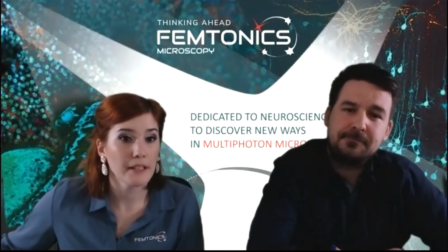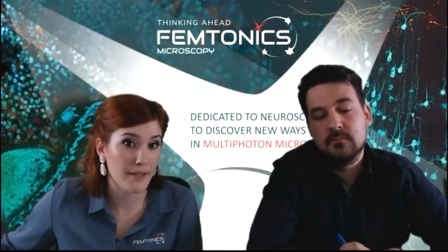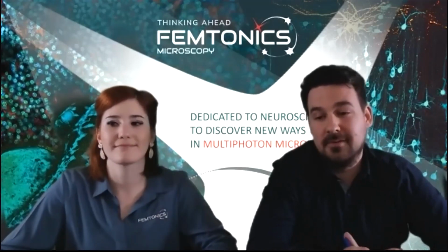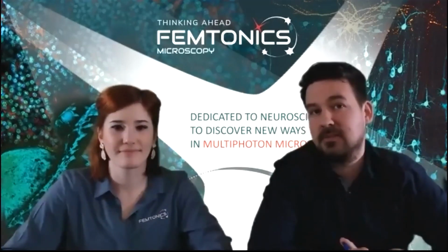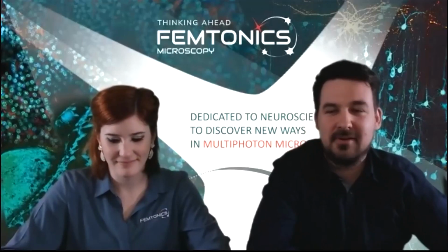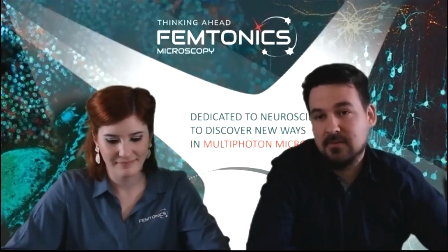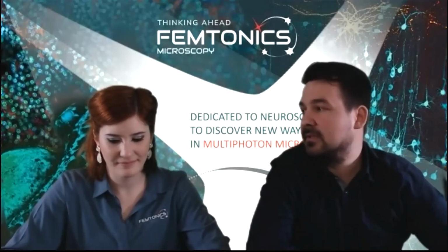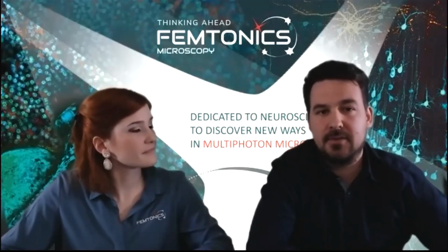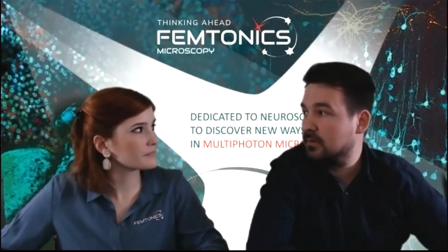Next one would be, how easy is it to switch between resonant and Galvo scanning? Oh, okay. Yeah, it's quite easy. It's only one click on the GUI. Everything is automatic, so you don't have to touch the rig. You can control everything from the software.